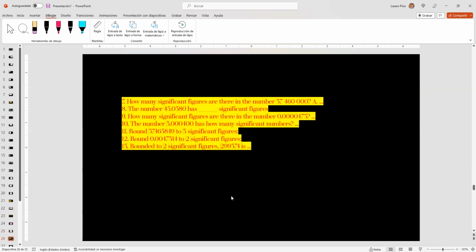Okay, here you have from question 7 to question 13. I want you to stop the video, answer these questions, and then you will report the answers at the end as I will show you.